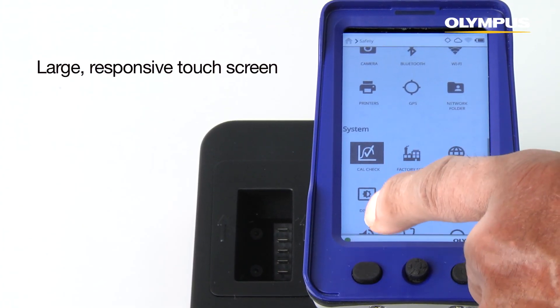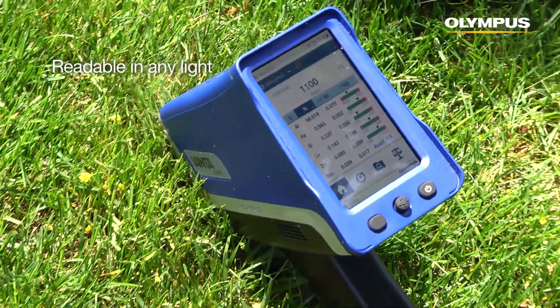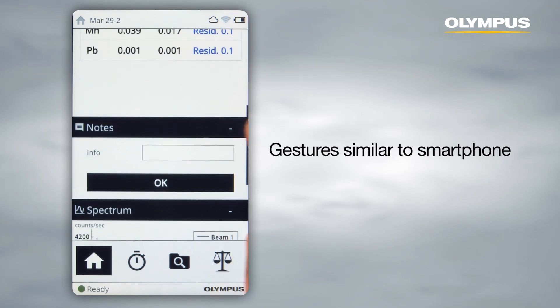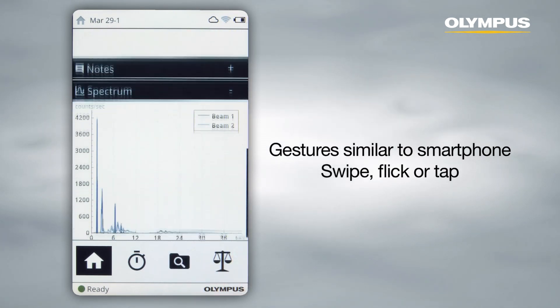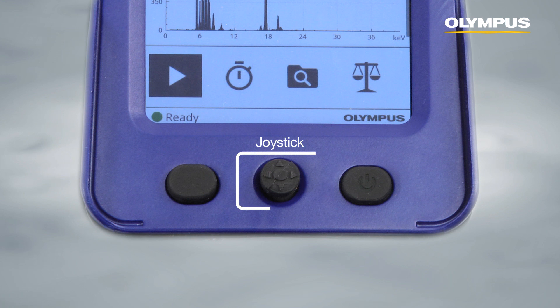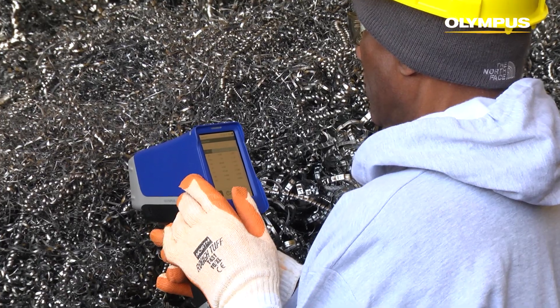Vanta's responsive touch screen delivers vivid images that are clear and readable in any light. The analyzer's user interface is simple to navigate — swipe, flick, and tap, just like on a smartphone. Three favorite buttons can be configured for quick access to your most frequently used settings. For operators wearing gloves, the Vanta's joystick enables a user to navigate the interface without touching the screen.